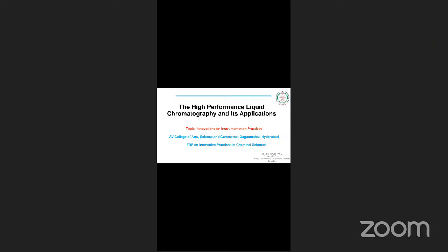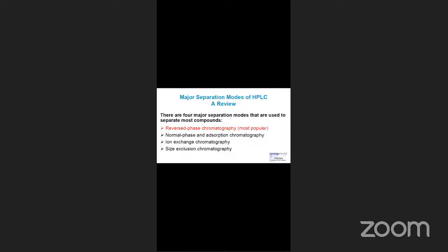Please go on. Okay, so I will go to the second part of the discussion, which is the topic I wanted to discuss with all of you: HPLC. There are essentially four ways by which liquid chromatography works. I'm calling it liquid chromatography, and we are all chemistry teachers here. I'm sure you have either heard of it, or used this separation technique while doing your research, or you might be continuing your research. The one I am going to talk about is reversed phase, but the ones we have been doing for a long time were normal phase, adsorption, ion exchange, and size exclusion.